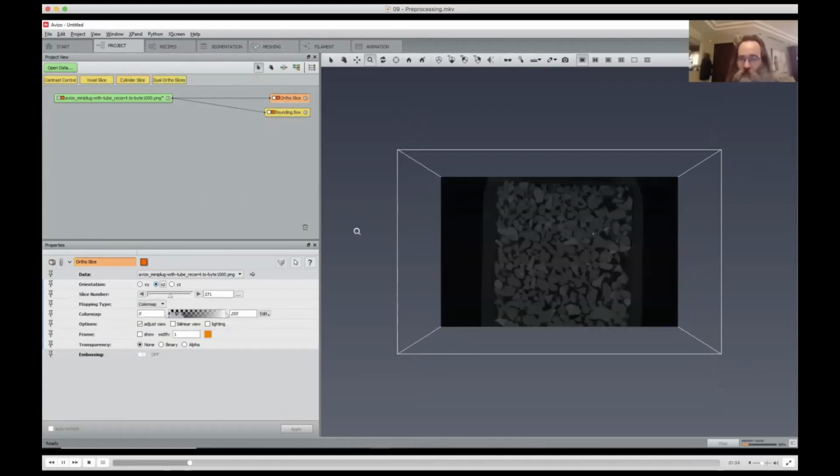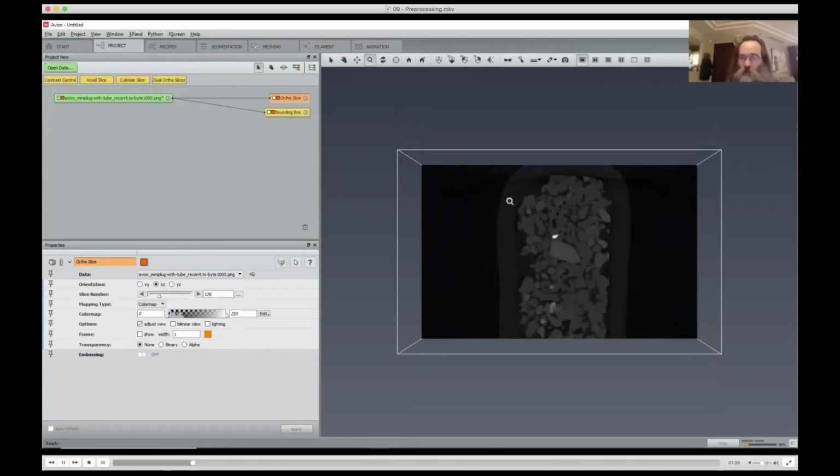If you look from the side and browse through it, maybe you're not interested in the bottom here, it's upside down, but in the bottom of the tube here, where things might get more complicated. Maybe you just want to know what the average portion of this tube looks like. So you could just look at the lower part of this volume. And what you can do in this case is what's called extracting a subvolume.